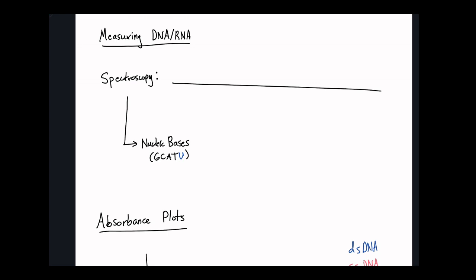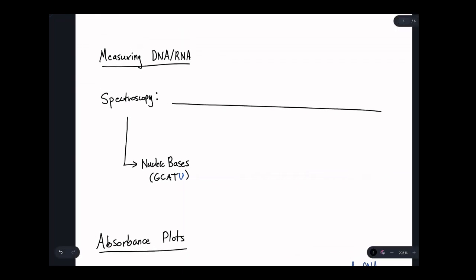2.7. In this video, I'll be covering the detection of DNA and RNA using spectroscopy, and it's the last section for the nucleic acids topic. With that in mind, what is spectroscopy? It's us as scientists probing chemicals with light. So if we have some sort of chemical sample, we can shoot different types of light through it, and seeing how that light is absorbed or displaced by the chemical gives us information as to what the chemical is.